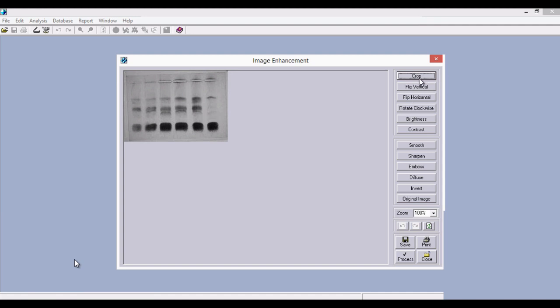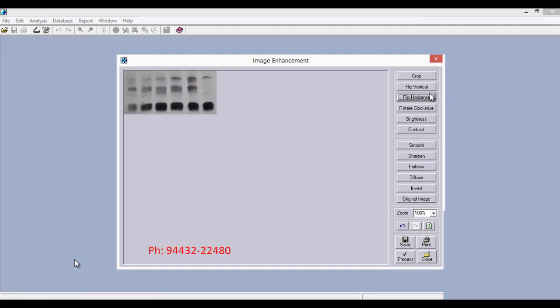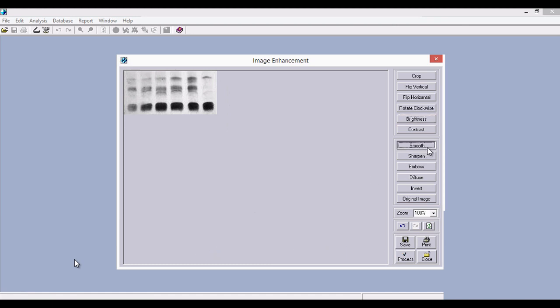You can see many buttons present here such as crop, flip vertical, brightness, contrast, and smooth. We can use these options to enhance the quality of the image captured through the camera. The first option is crop — this selects only a portion of the image for analysis. I am choosing this area here. We can flip the image vertically or horizontally using these two buttons, and also rotate the image clockwise by clicking this button. We can also adjust the brightness and contrast so that the bands and lines are clearly visible and background noise or dots are removed. You can also use the smooth button to fine tune the image quality.